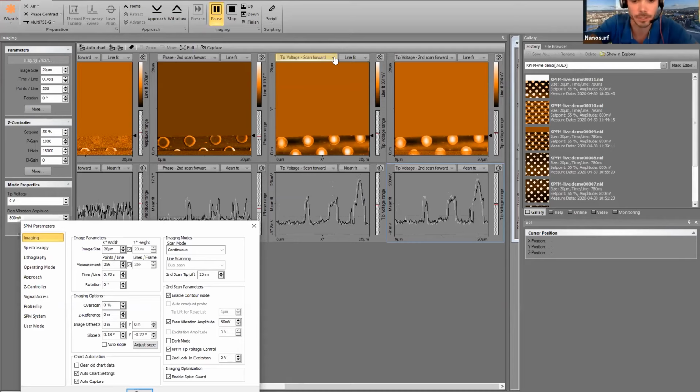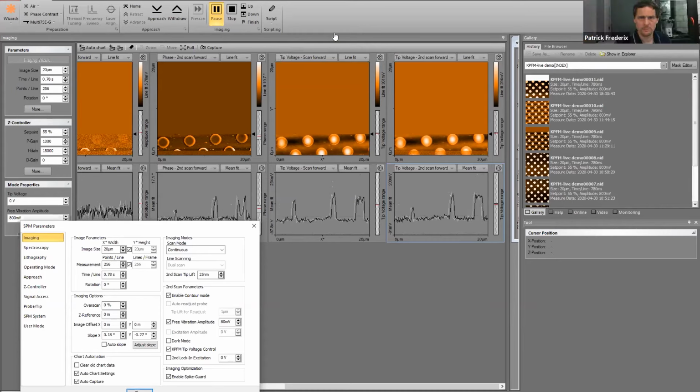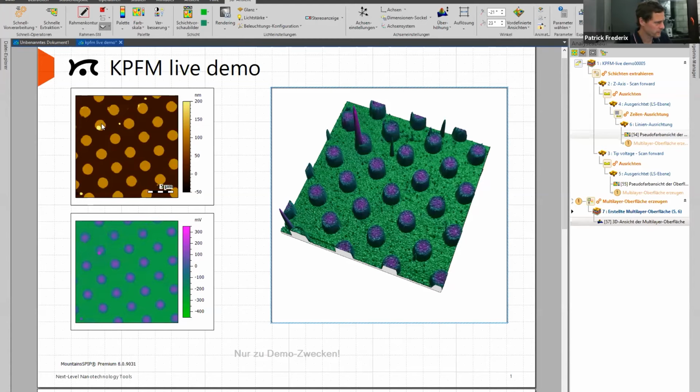And there's a question about the SPIP software: the image you showed there on the upper left was a pedestal with a kind of spike. And the question is, what's that spike? Yes, okay, let me change the screen to that one. So you're talking here about the left top here, the yellow dot.